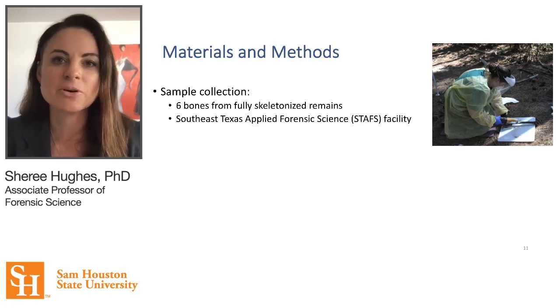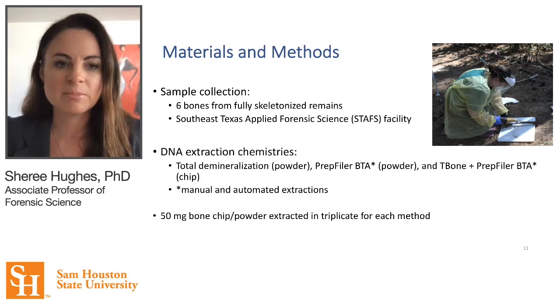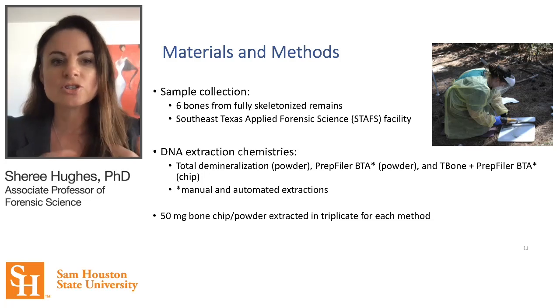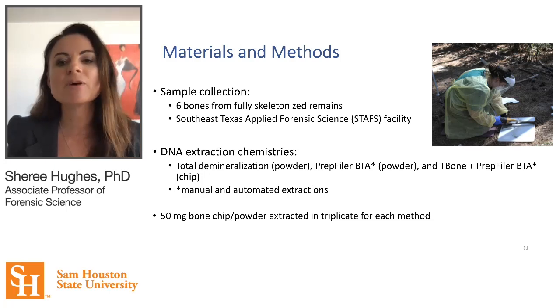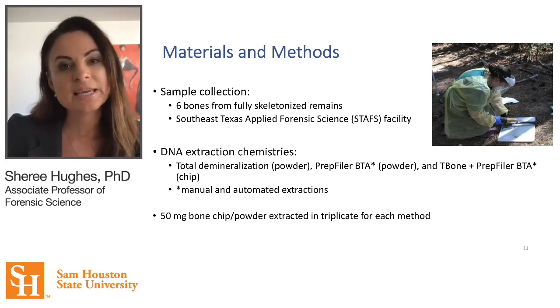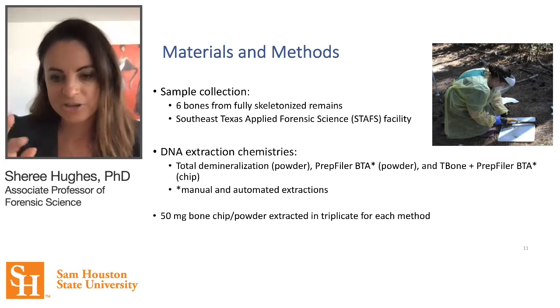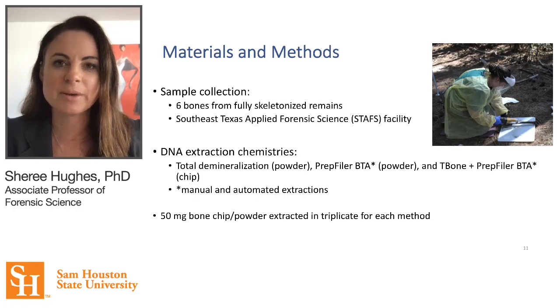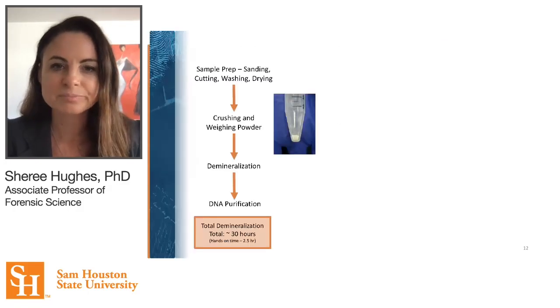So we collected 6 bones from skeletonized remains out at STAFS at Sam Houston State University, and we subjected them to those DNA extraction methods: the total demineralization protocol from powder, PrepFiler BTA from powder, and then PrepFiler BTA combined with the T-Bone buffer from the chip. And then a combination of manual versus automated downstream purification on the AutoMate Express.